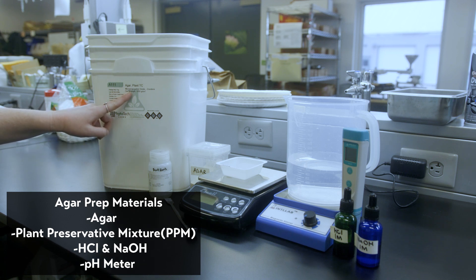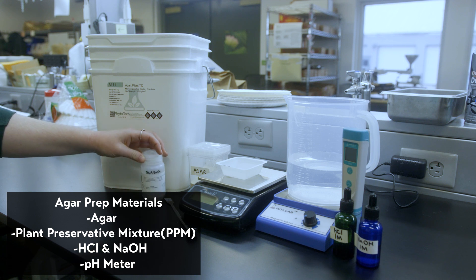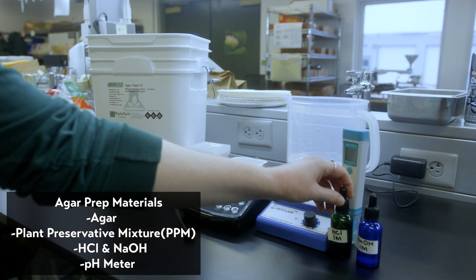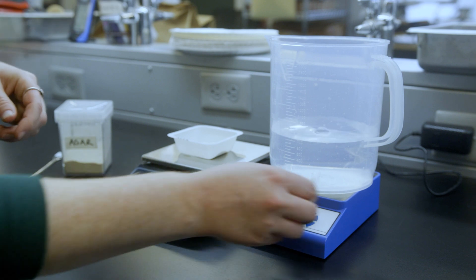To prepare agar, here are the supplies needed: agar, plant preservative mixture or PPM, which helps prevent mold growth, HCL, NaOH, and a pH meter.